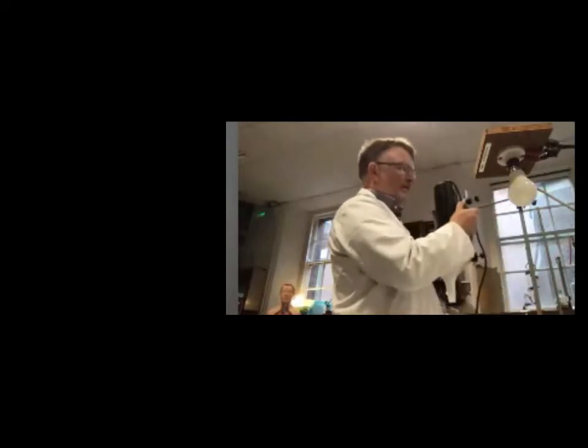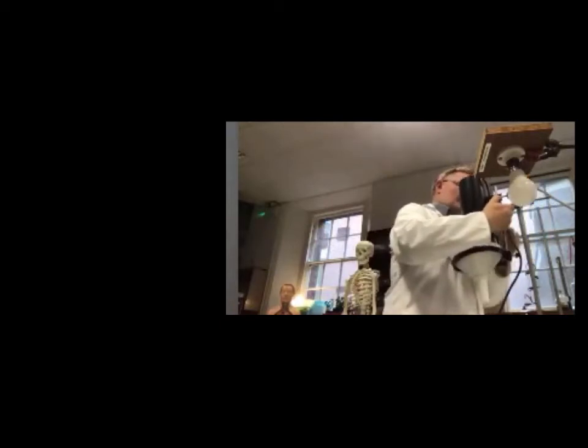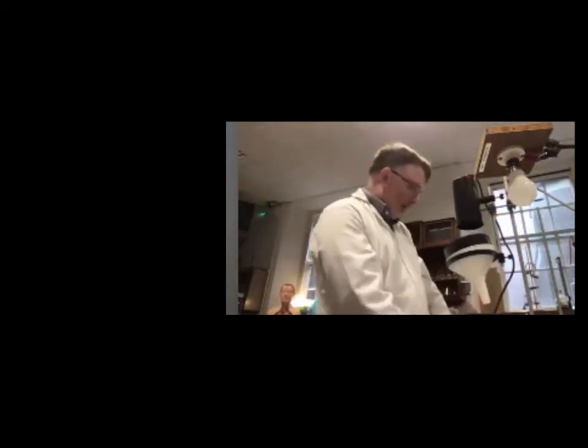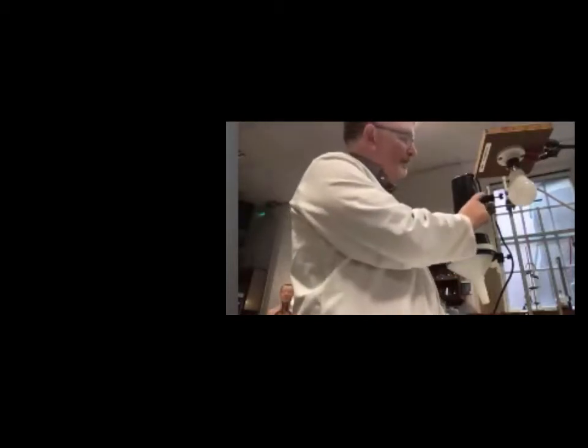So, retort stand. I've got a boss connected there. Normally you might need this rod here, but you can put it straight onto the retort stand. But the ones here, I think, are pre-metric. So we'll do that one. Now, what I'm looking for, I was just checking to see, was there another one of these retort rods, they're called.